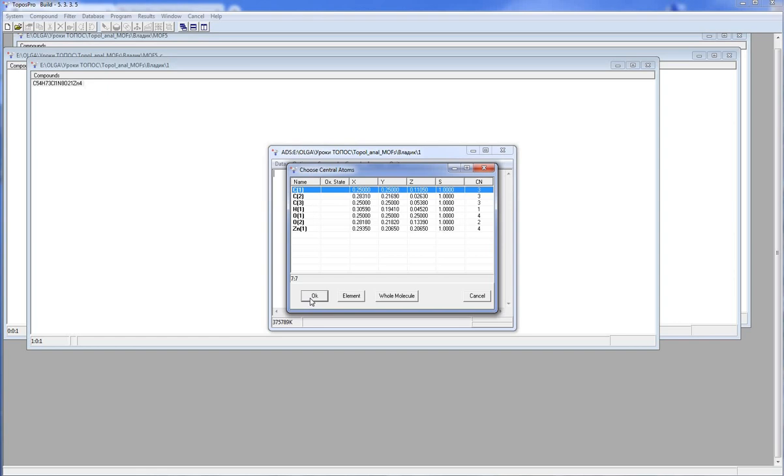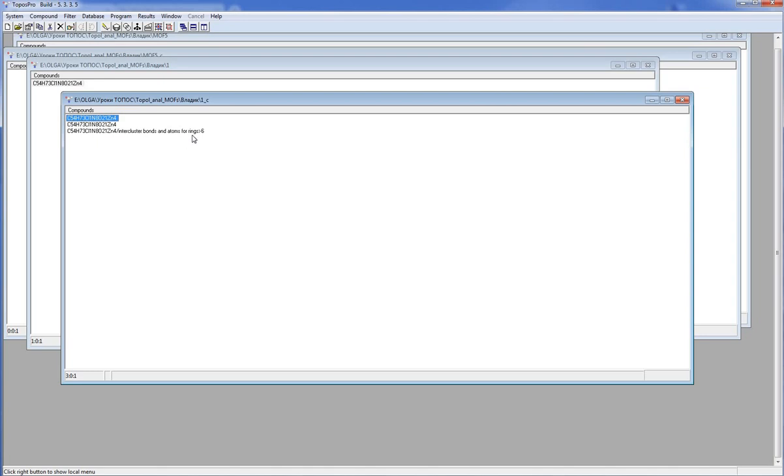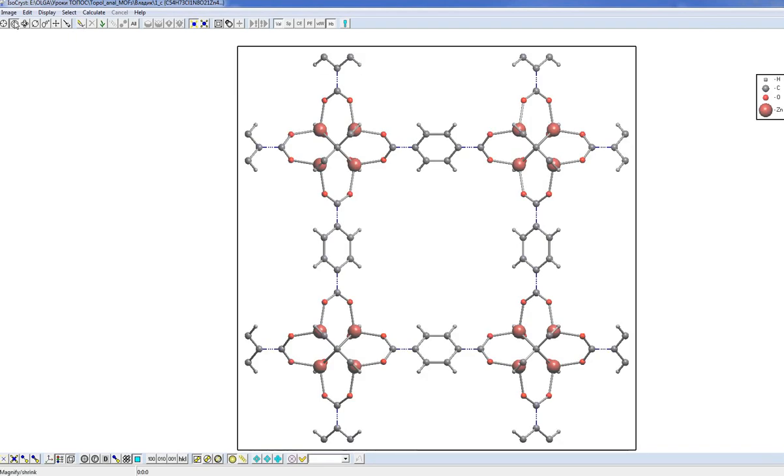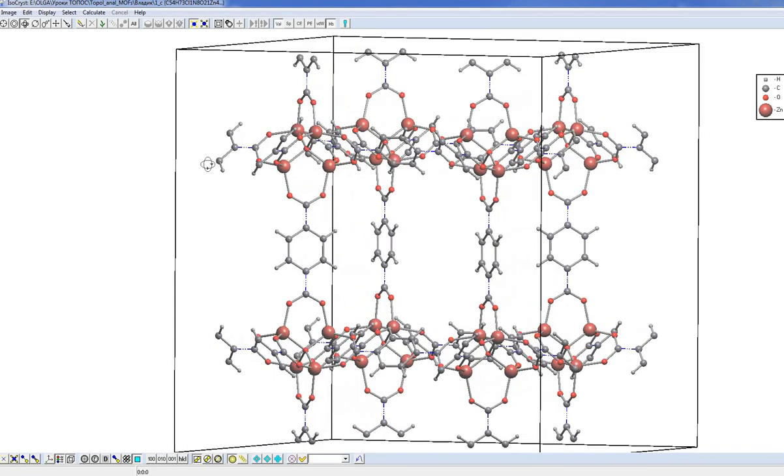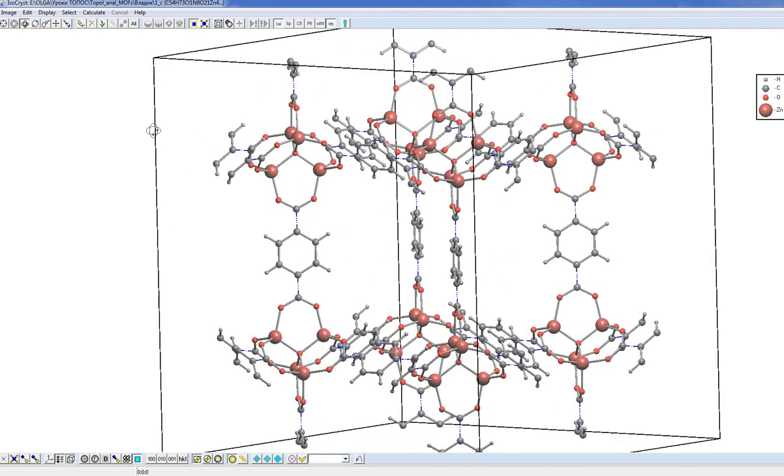Topos Pro creates possible representations of the structure as the sets of structural groups. We have a new database with the same name, but with the suffix C. Let's look at the structure. You see, Topos Pro has split the structure into four nuclear groups and linkers between them. How did Topos Pro recognize the structural units?